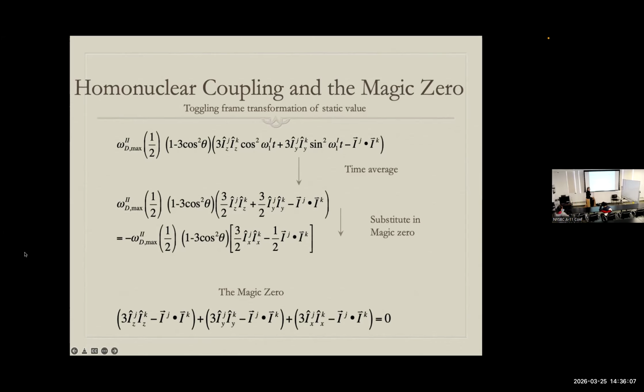So what we should probably be doing to solve actual problems today is either have a new breakthrough in the whole concept of a pulse sequence, which I don't know what that would be, but I imagine it's out there someplace to be had, or just do great. Just do great.